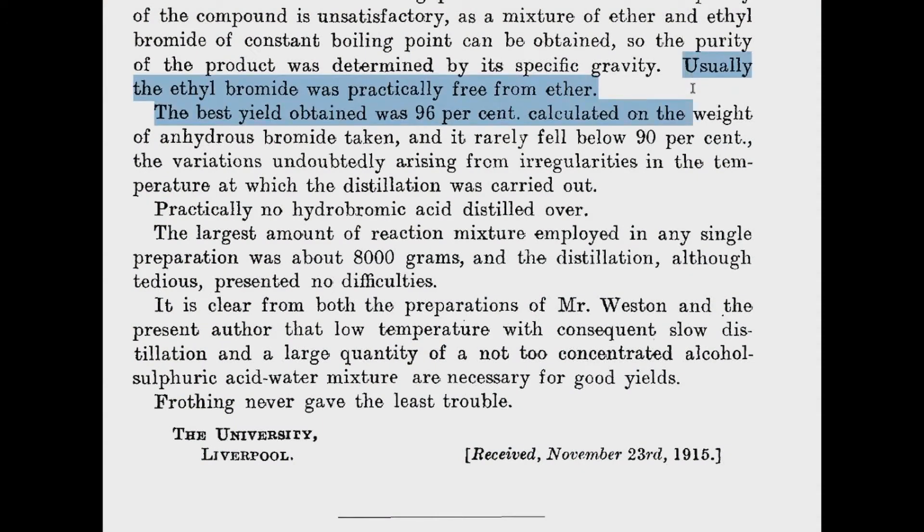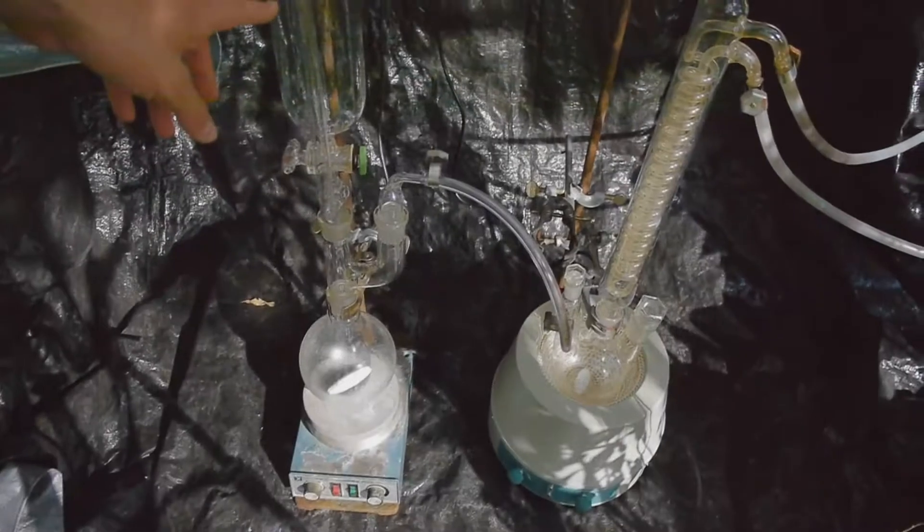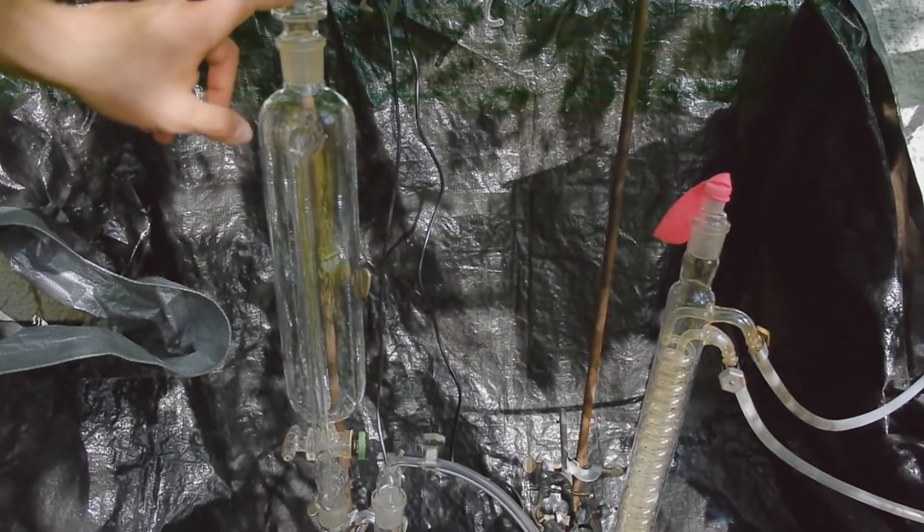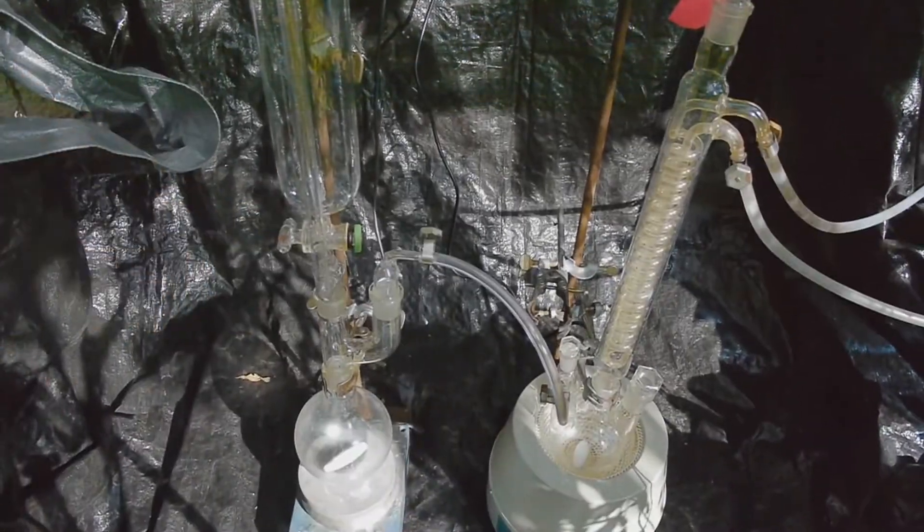The synthesis of ethyl bromide has been optimized to practically quantitative yield with no side products over more than 100 years ago, and I thought I was clever and could come up with a better synthesis. Also, maybe I didn't do my research properly.